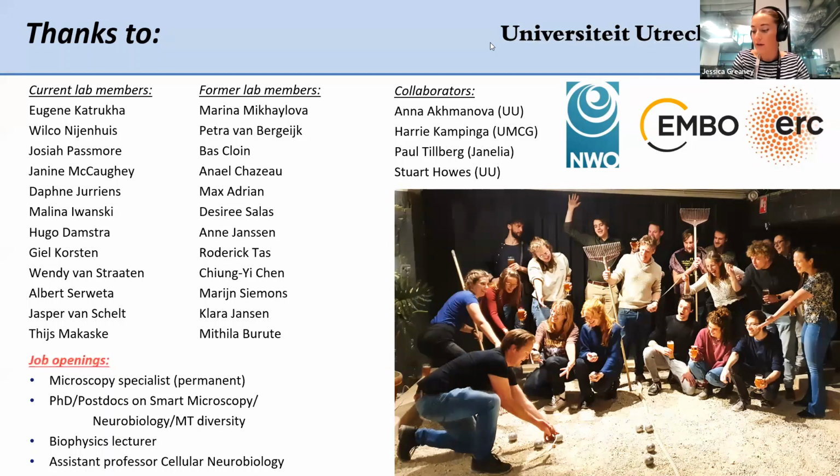So I was interested in the MotorPAINT technique, where you can reconstruct the microtubule network by looking at the tracking of kinesins, I believe. I was wondering how that would differ, and if it was maybe a more accurate way than using tracking of end binding proteins like EB3 or EB1. So how would that differ from tracking it that way?